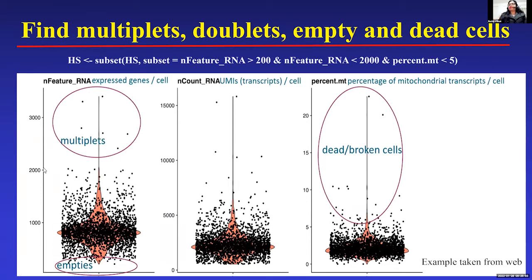There are other methods to remove these, like scrub and others, which differ depending on Python and other models, and depending on the data that you're using and the level of stringent analysis that you want to do on your data. We can choose different modules to do a more stringent quality check.